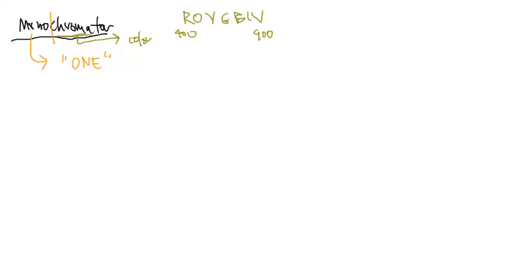All of the metals, like we've said before, are very specific to one wavelength. Some of them can have multiples, some of them can just have one or two, but we're talking about one number in particular that they respond to the best.